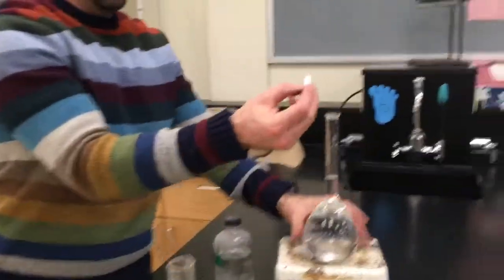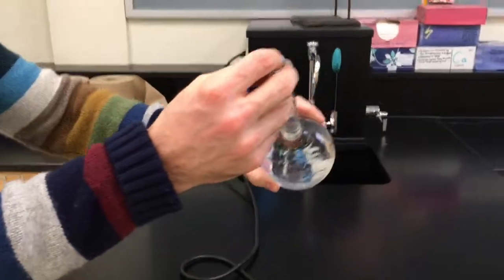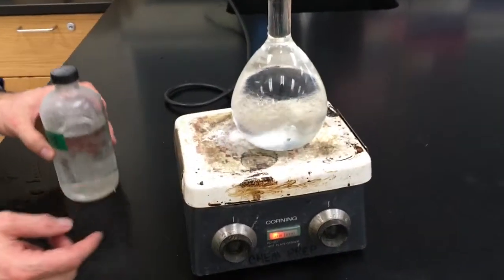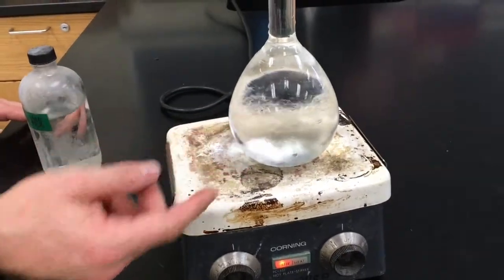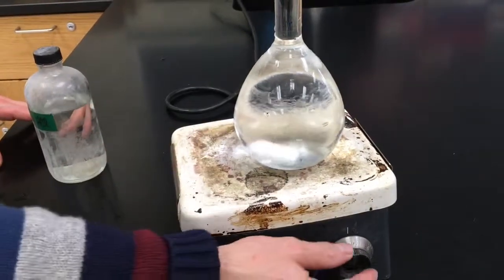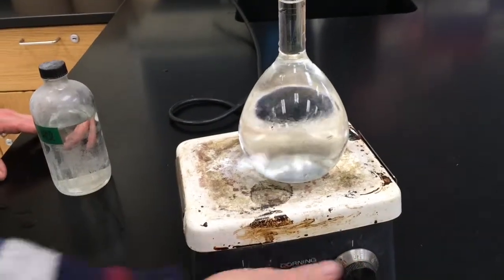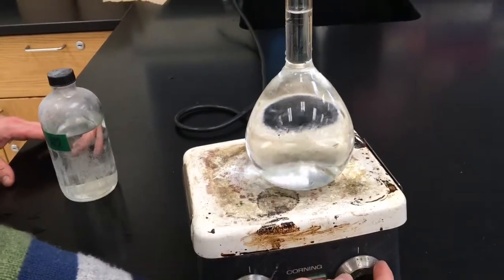Alright, so now, magnet, it's kind of cool because, oh, you know what? You're going to be able to see this. It's going to look cool. Look at, you can see the acid and how it has a different density, a little different viscosity than the water. So I'm gonna kick up the notch, and you can see it start to mix.